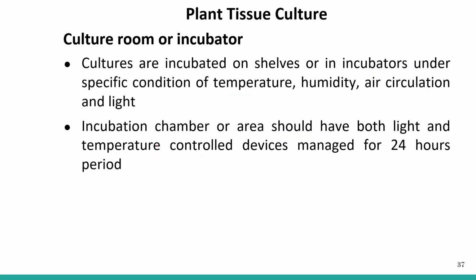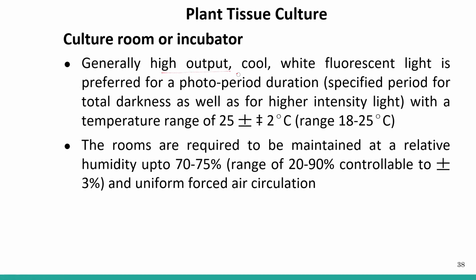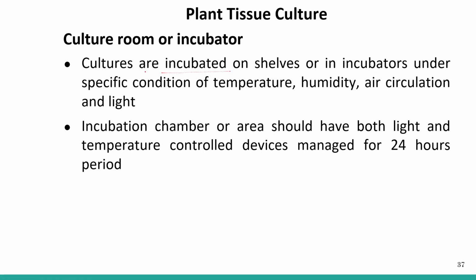Culture room or incubator. Cultures are incubated on the shelves or in incubators under specific conditions of temperature, humidity, air circulation and light. All the cultures should properly get air circulation. Temperature should be maintained. Humidity should be maintained in the incubator so that in that particular condition our culture can grow.